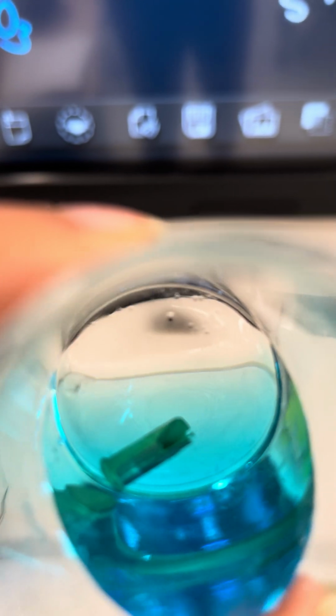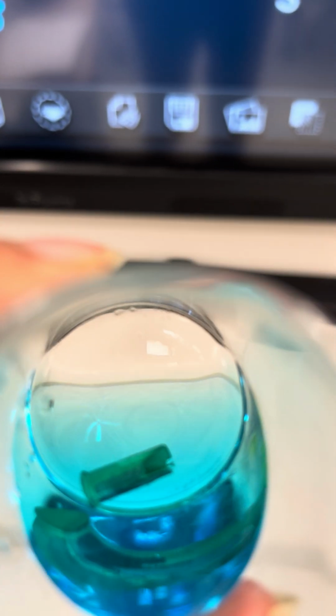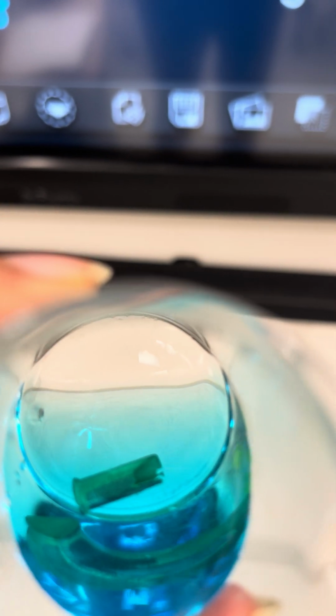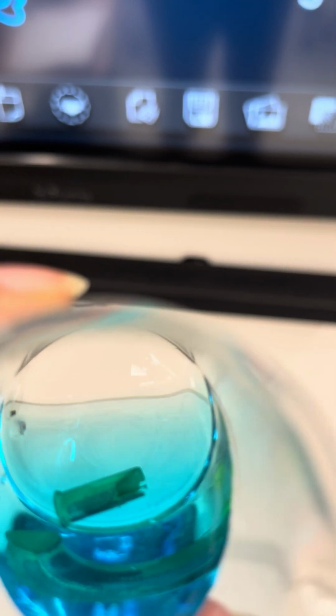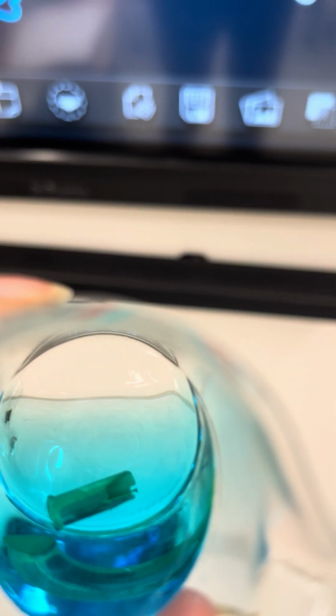Okay, in this lab, we're gonna get a brass bullet. Brass is made out of copper and zinc, and we are gonna put it in nitric acid. Nitric acid is going to dissolve the copper and the zinc, which will go into solution, and once we do that, we're gonna find out how much copper is in the brass bullet. That's the whole purpose of this lab: to find the percentage of copper in the brass bullet.